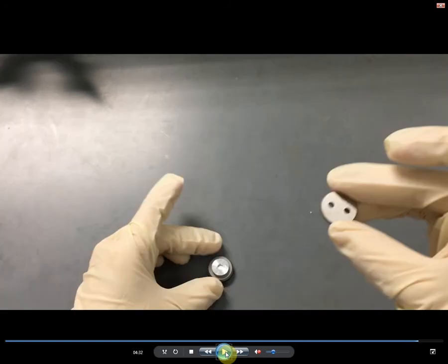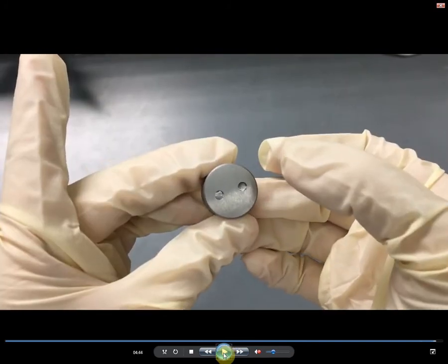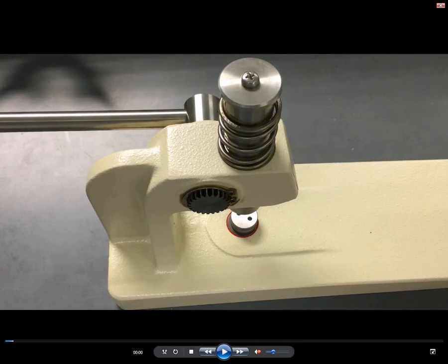Remove any excess powder on the surface of the frame, if any, using the Kim wipes. Next, fix the upper cylinder. This is how the final setup of the lower cylinder, frame, and upper cylinder will look like. Place the assembled setup onto the hand press.